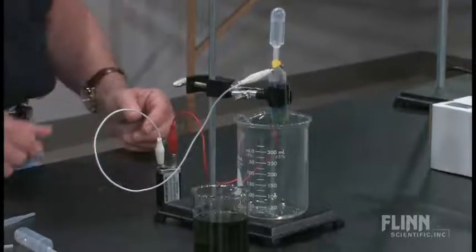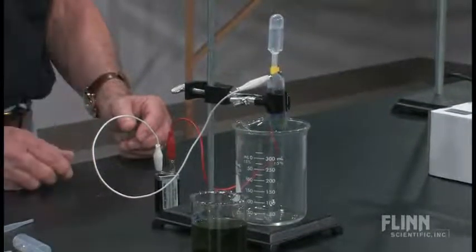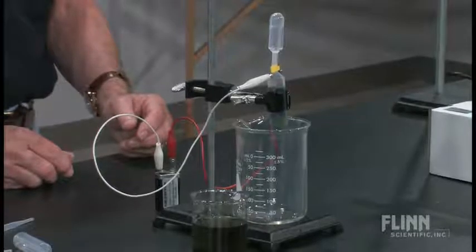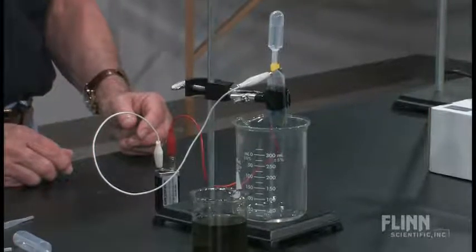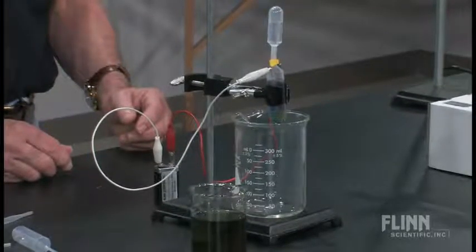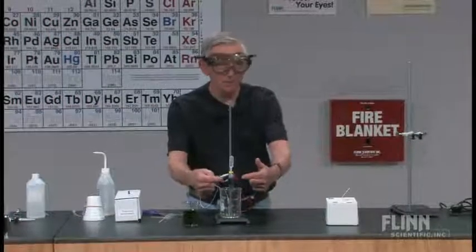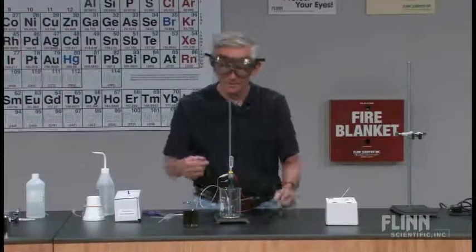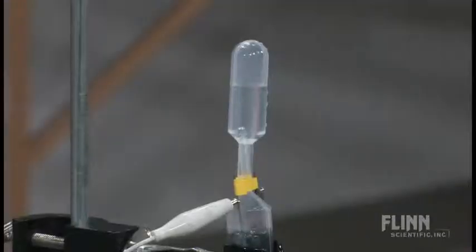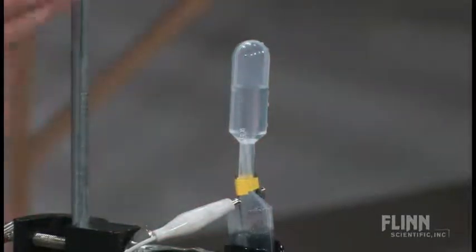Why don't I see two streams of bubbles? I never thought of that question until I did this in front of a class last April. A student said, why aren't there two streams of bubbles? And I didn't have an answer. I mean, I was prepared to point out that there are two streams down here. But then somebody else in the class said, you idiot, there's only one tube. Wasn't my fault. So we're going to wait for this to go down.